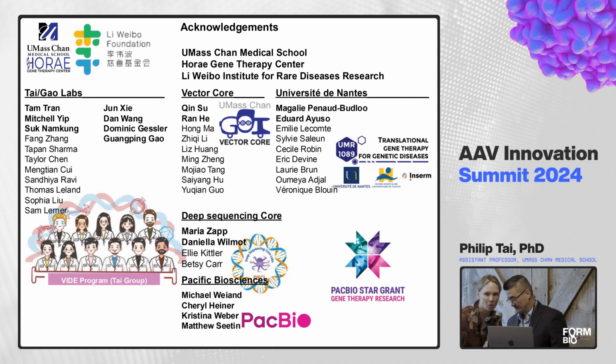I think we have time for one question, if there are any questions in the audience. Okay, so on the flip and flop, like the ITR characterization, how do we use that information? Are we using that information to design better ITR sequences? So currently, the ITRs that are being used in all production platforms are based on AAV2. There have been several groups that have been designing synthetic ITRs to see whether they perform better.